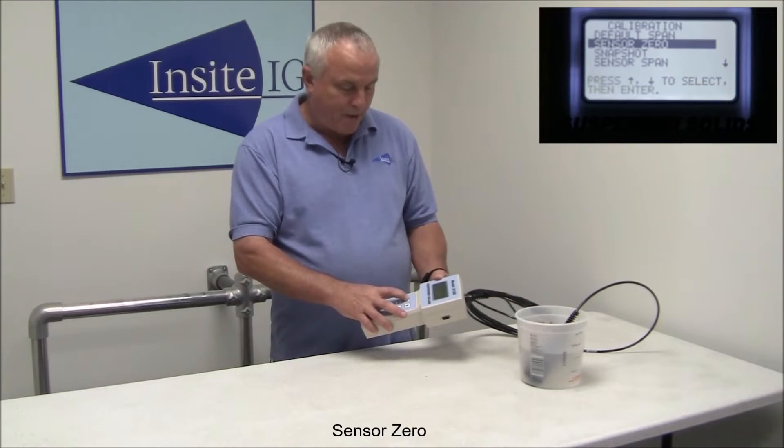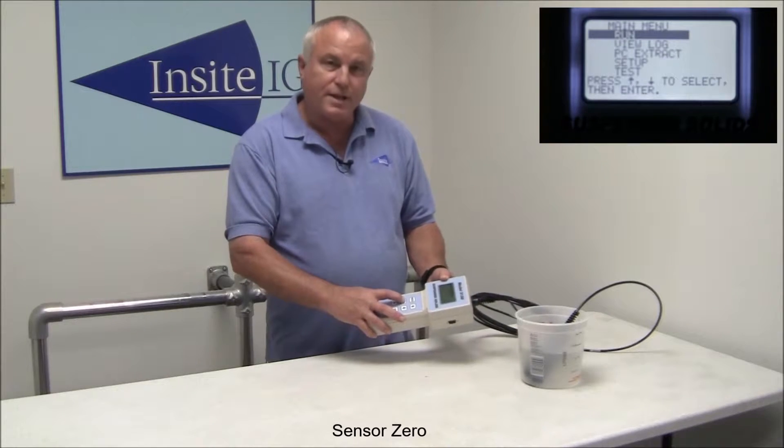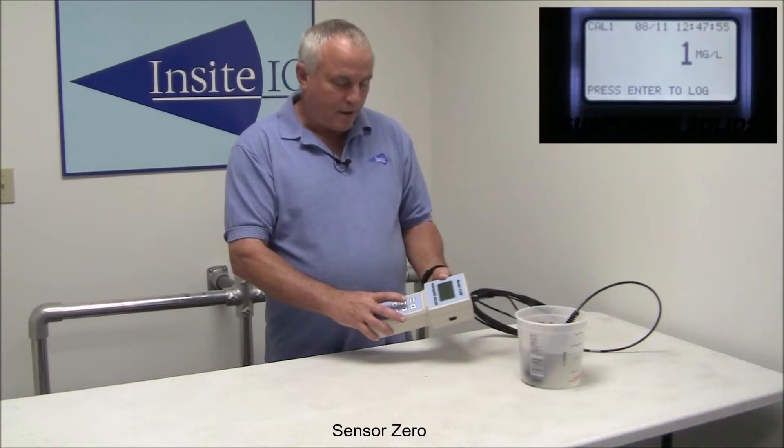Now we just menu our way out, back to the run mode. Press enter — it comes up zero.